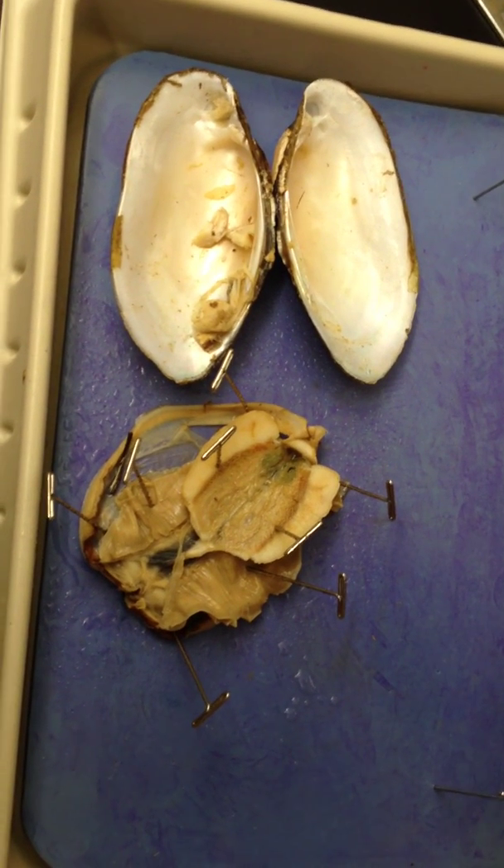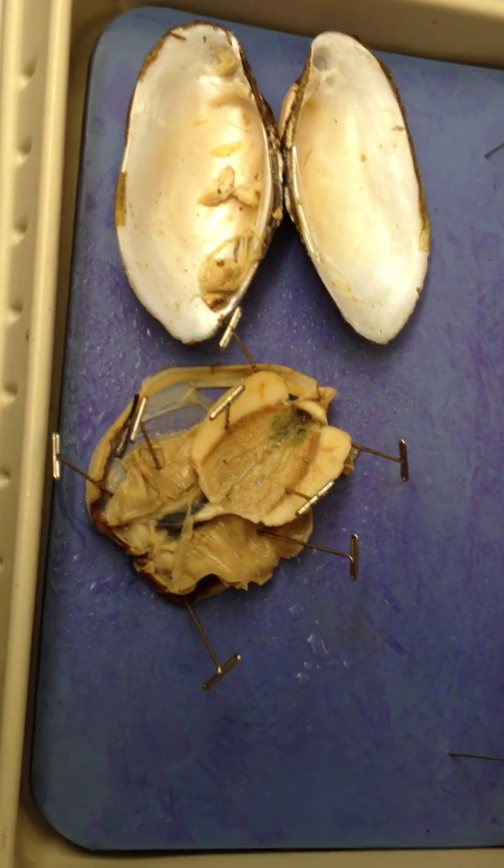This is a clam, phylum Mollusca, class Bivalvia.